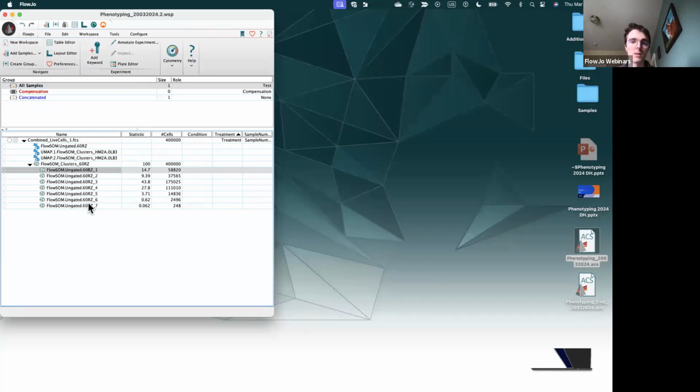And so what I'm trying to do today is identify why the machine learning algorithm grouped these cells together the way that it did and what these phenotypes are, and whether I need to cluster them further to separate out further phenotypes, or maybe even merge them together if it clusters too much. And then a UMAP is just a visualization of my data. It hopefully groups cells again based on their similarity. So okay, I ran clustering on this data.